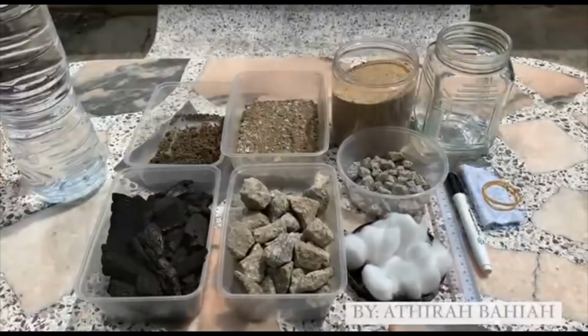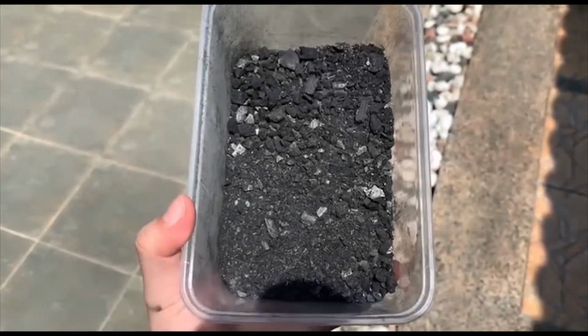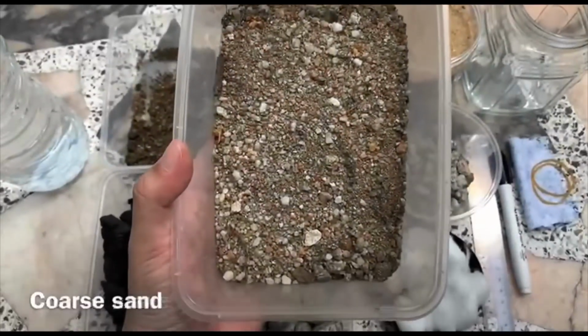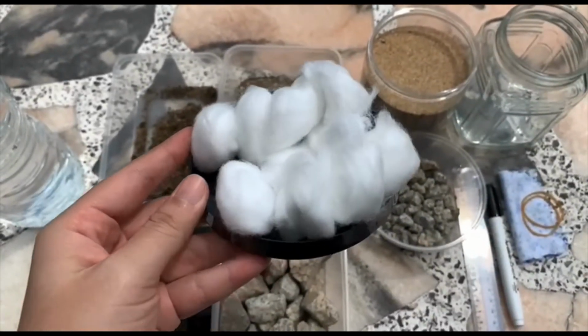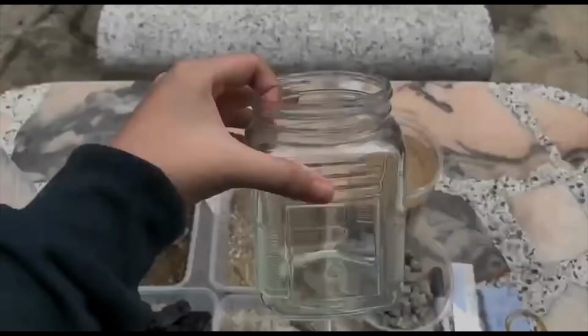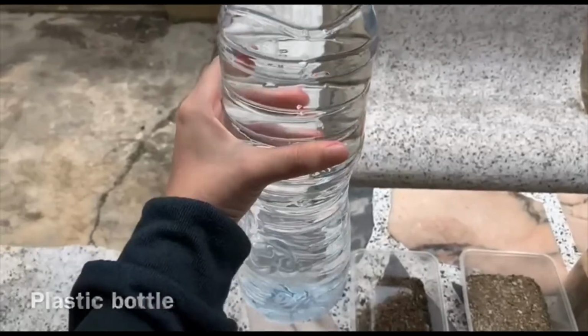So here are the materials for the design tree. First of all, there is charcoal and it needs to be crushed. And there is a coarse gravel, coarse sand, fine gravel, cotton wool, cloth with the band, a jar to capture the water, and a plastic bottle.